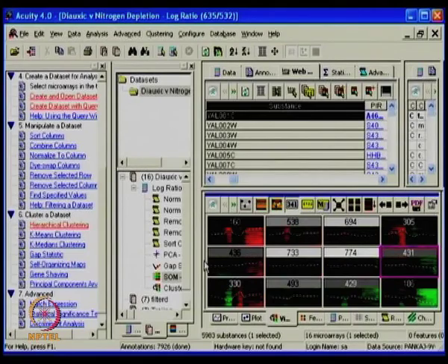Because I have given 4x3, I will be able to see 4x3: 4 columns and 3 rows. Independently that is being divided, so one can have any numbers. The idea comes from the hierarchical, but here the clustering gives an immediate response: this was very low, again it went down and you are able to see it go up again. So in different time codes it's a different expression. Based on the behaviors you can see this is being grouped up.